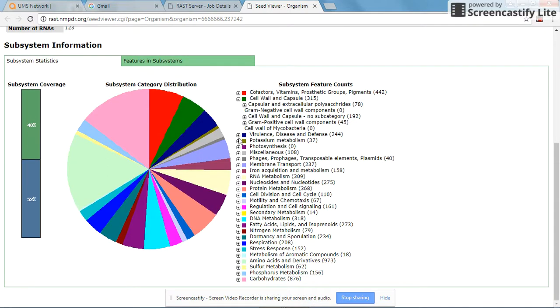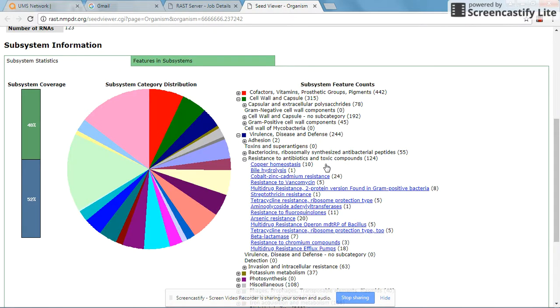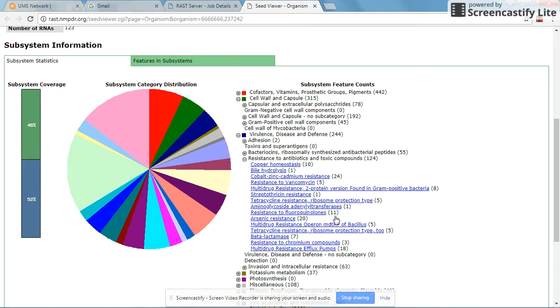The next thing you will look at is virulence, disease, and defense. You can look at bacteriocins if you are mining the genome for bacteriocins for recombinant expression studies. You can also look for resistance to antibiotics and toxic compounds if you are looking for antibiotic profiling of pathogens. In this case, there is a resistance to fluoroquinolone with 11 subsystems.